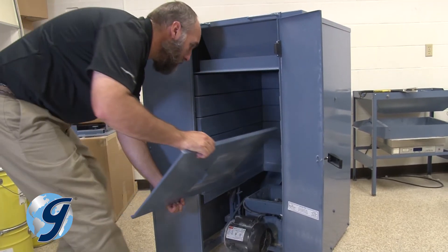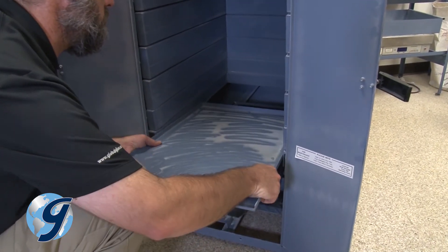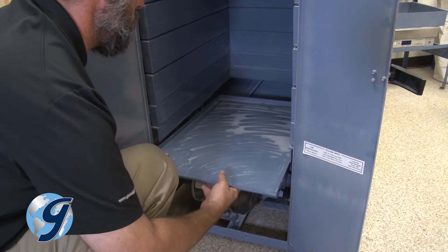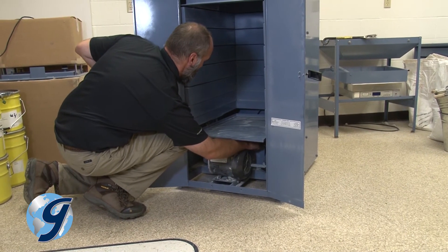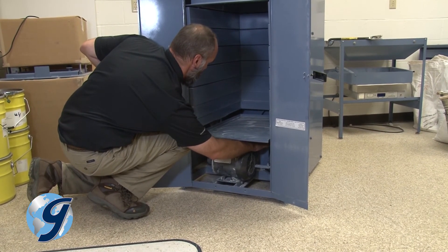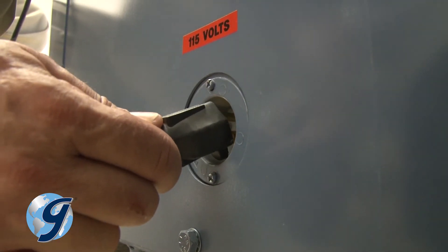Now we are going to reattach the protective drive case cover. Slide the case panel into position and screw it into the unit. The screw hole is located under the drive case cover, centered and towards the back of the unit. Plug in the power cord into the rear panel.